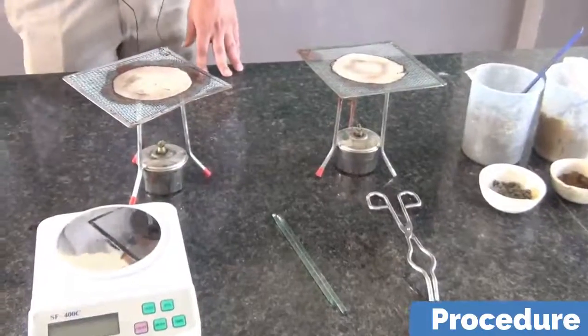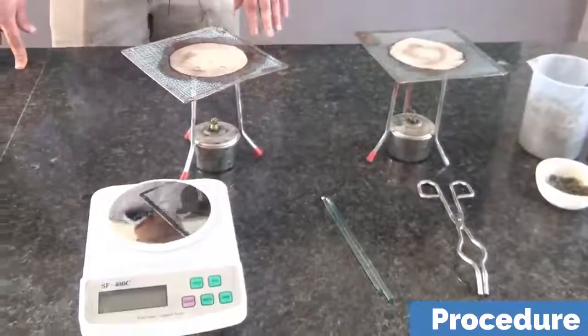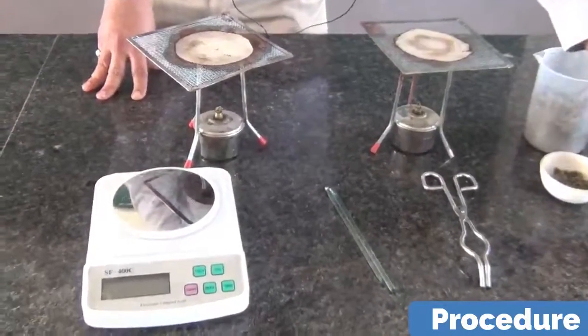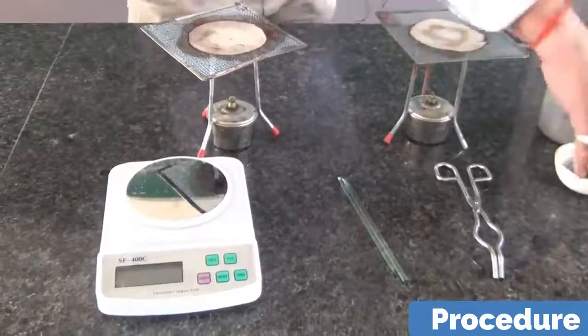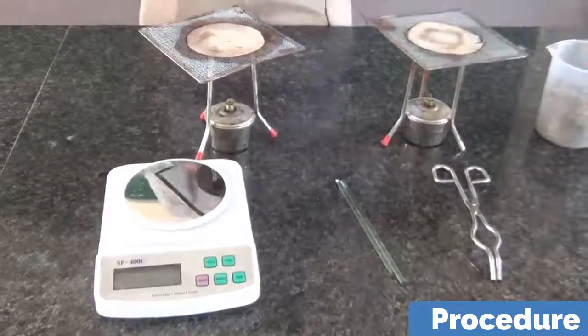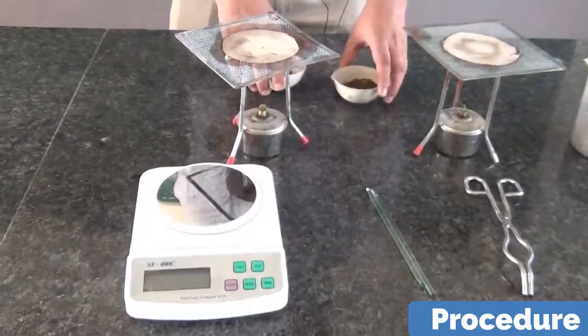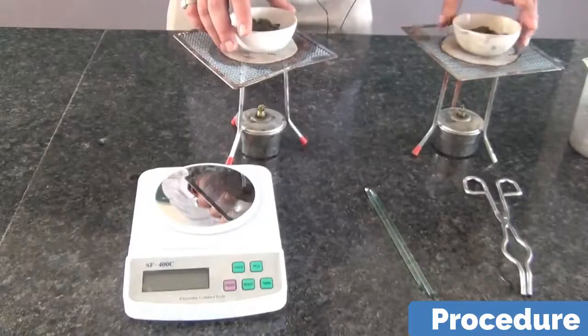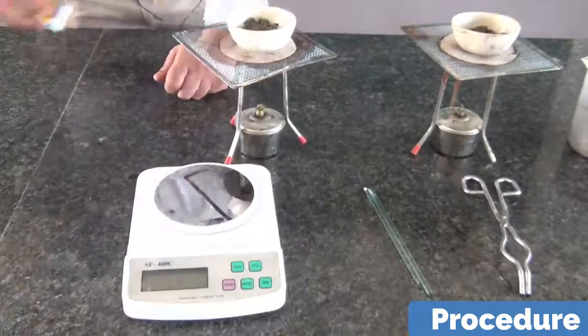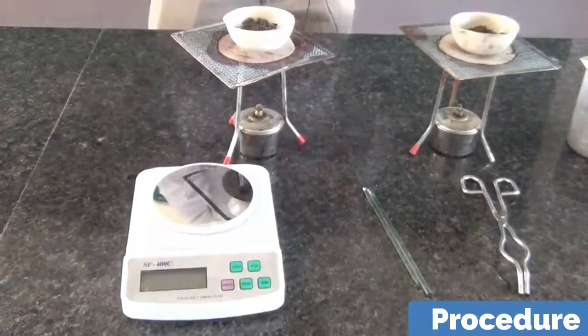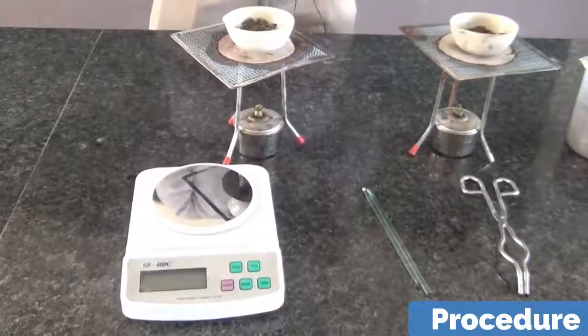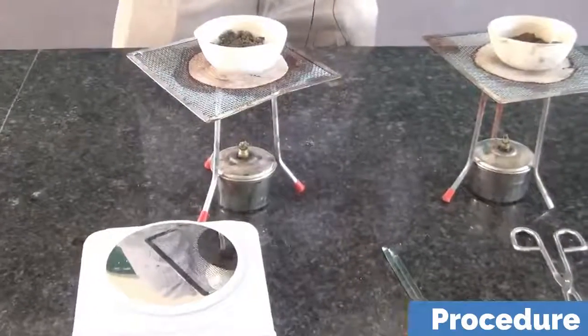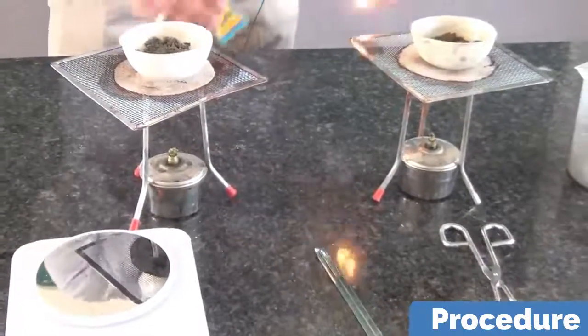Now let us talk about the procedure. First of all what we have to do is we have two soil samples. These two soil samples we have to heat for about 10 minutes. We have to keep them on the wire gauze and heat them for about 10 minutes so that the water content which is present, the water moisture which is present, it goes out.